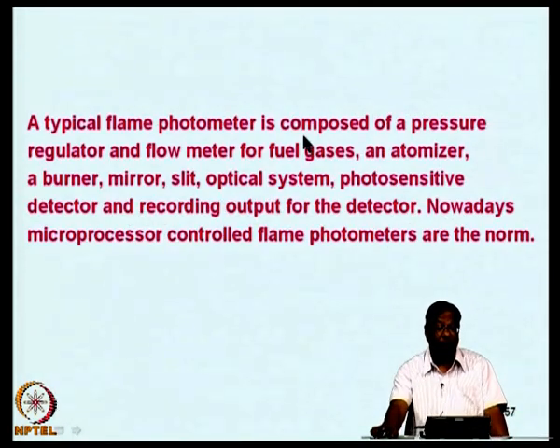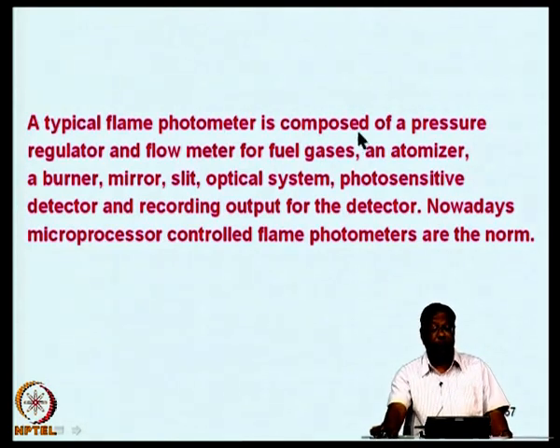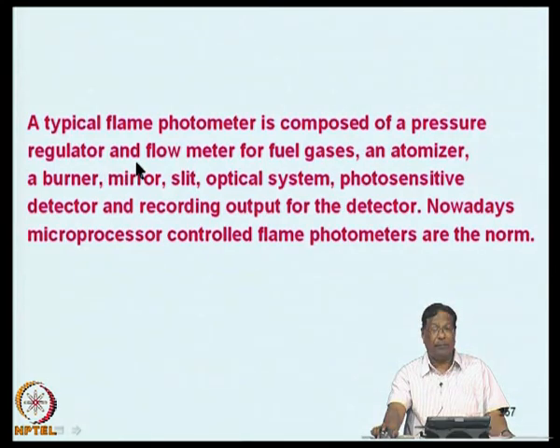So, a typical flame photometer is composed of a pressure regulator, and now I am talking about the dedicated flame photometers.